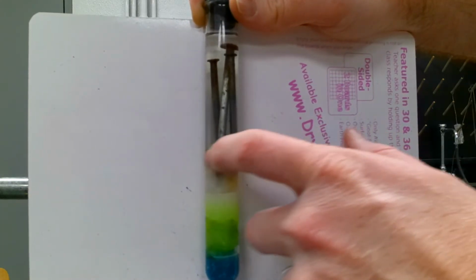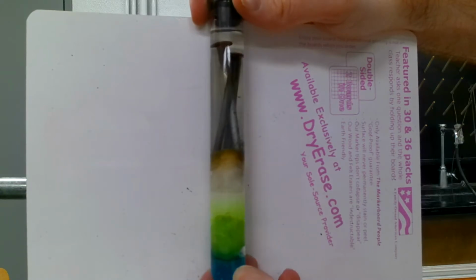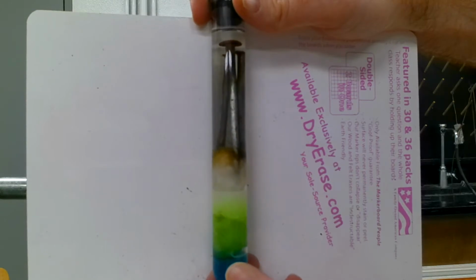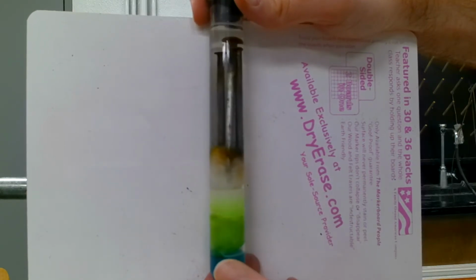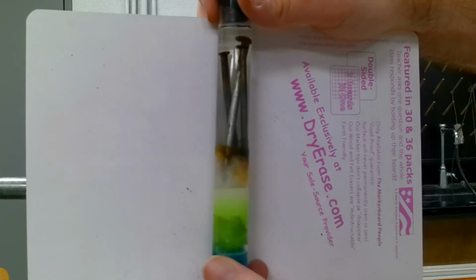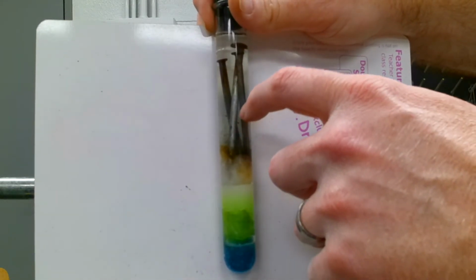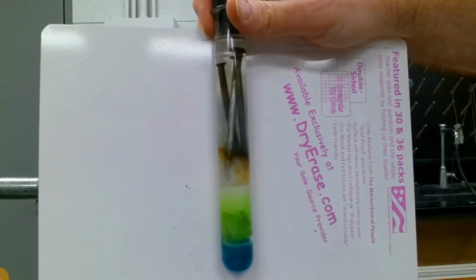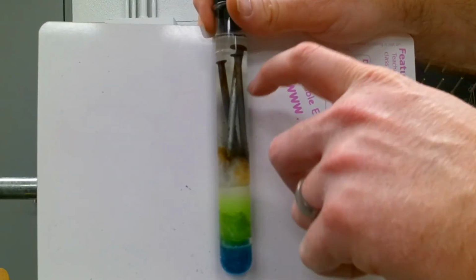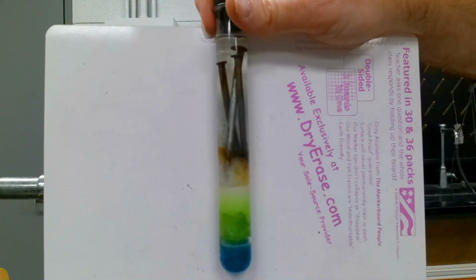And you see some type of orange stuff that's kind of floating in here. If I kind of move it around, it's a solid that is floating around. Kind of like a precipitate. It's not exactly a precipitate. It's more of a solid that's happened. So not exactly what I expected. I expected copper to make it all the way on top of and actually plate the iron, which is actually what you should see when you put a nail into copper sulfate solutions. But this one is really cool and really interesting to see.